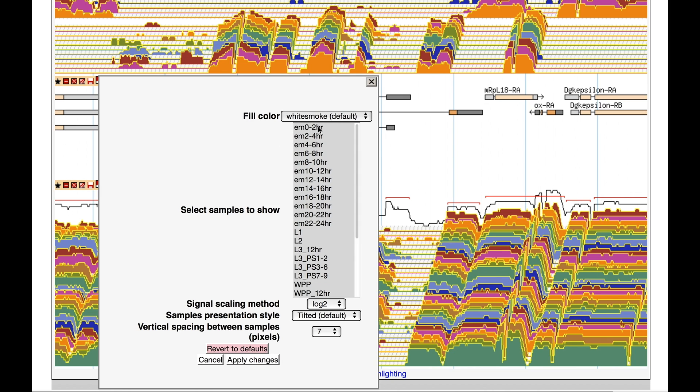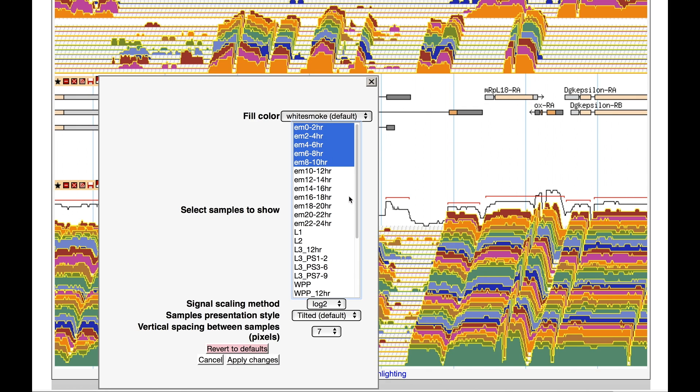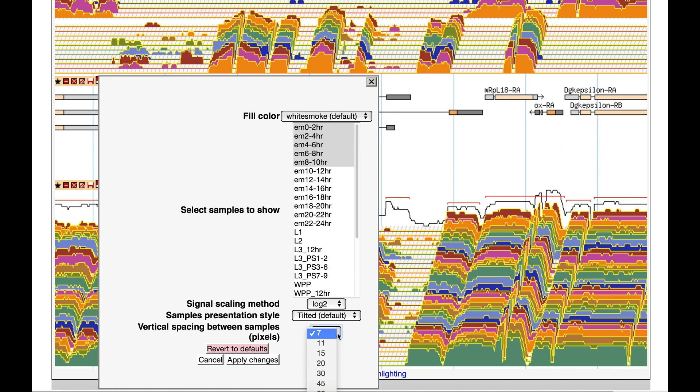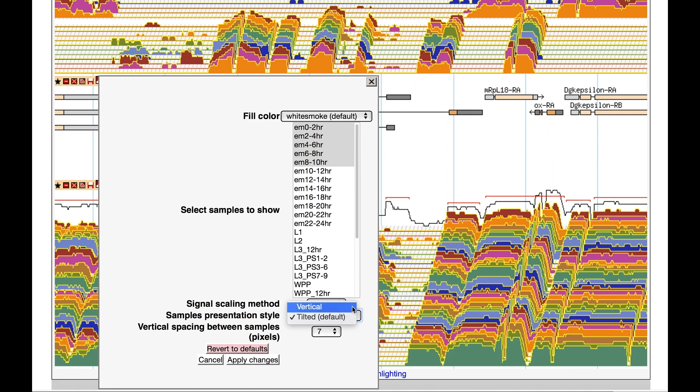First, you can limit the view to a subset of samples by selecting adjacent samples. You can choose to increase or decrease the vertical space between the samples. You can choose vertical rather than the default tilted view to remove the sample offset.